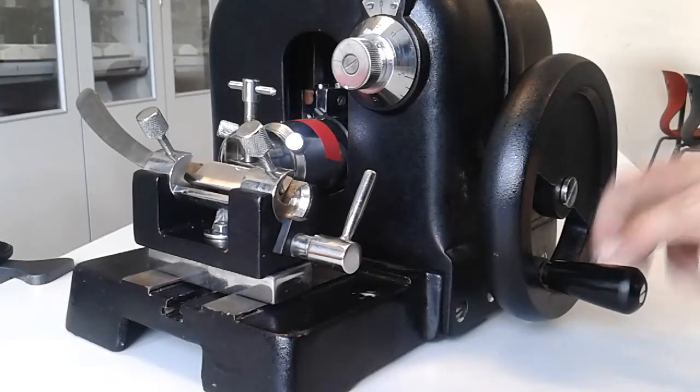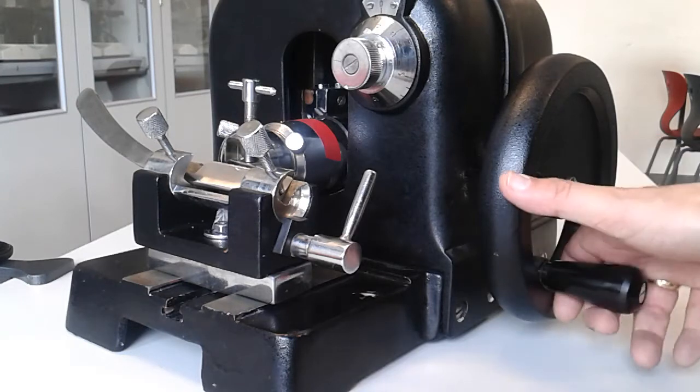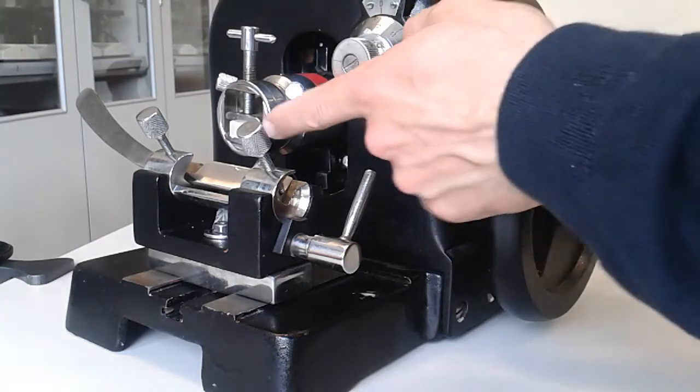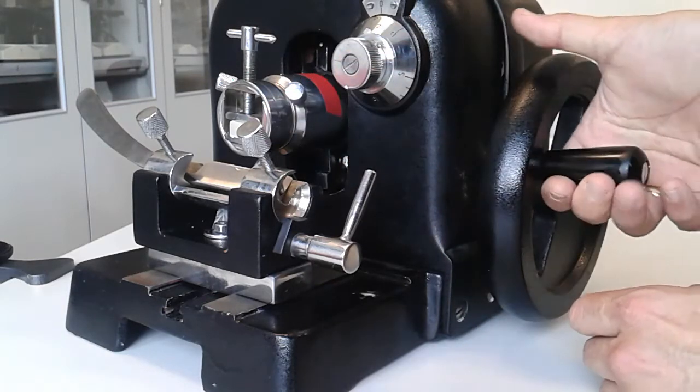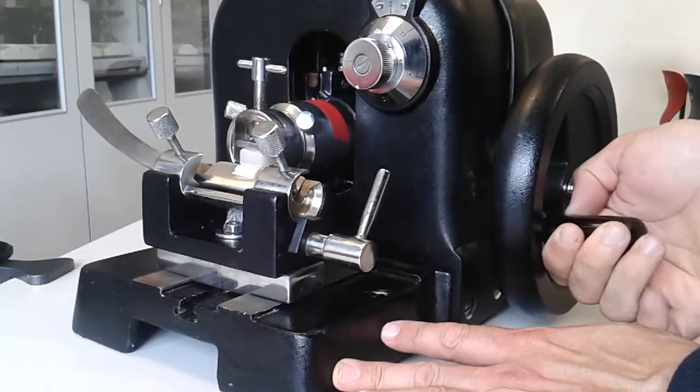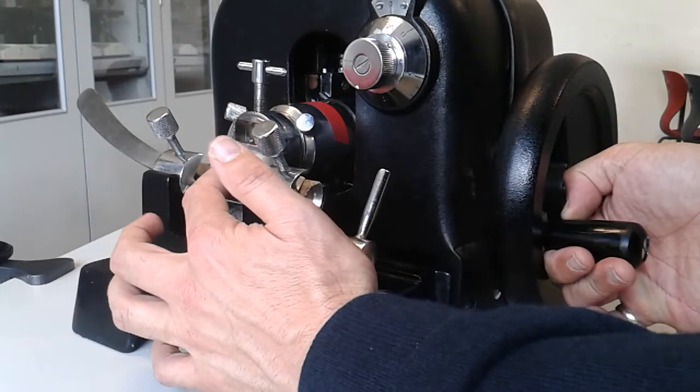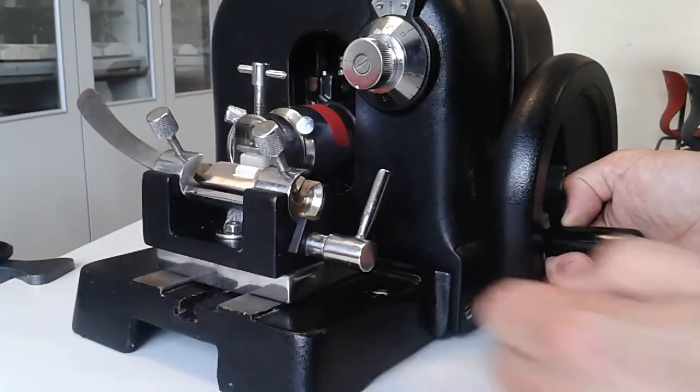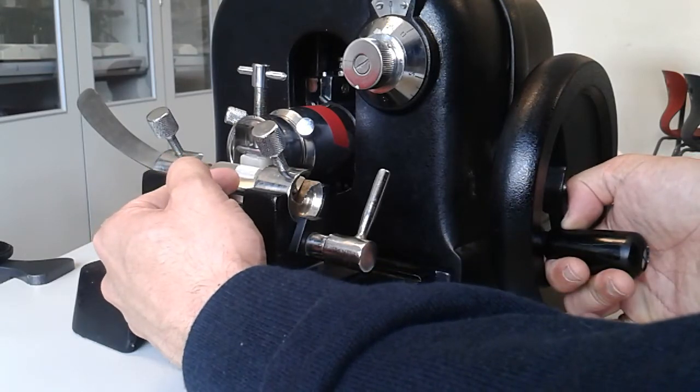When you use a rotary microtome, you first have to operate this crank over here. You can see that the specimen, which is embedded in paraffin, is raised and lowered. At the same time, the specimen also moves forward a little bit. As it passes by the sharp knife over here, it makes a very thin cut, and you can take the thin cut and put it on a microscope slide.